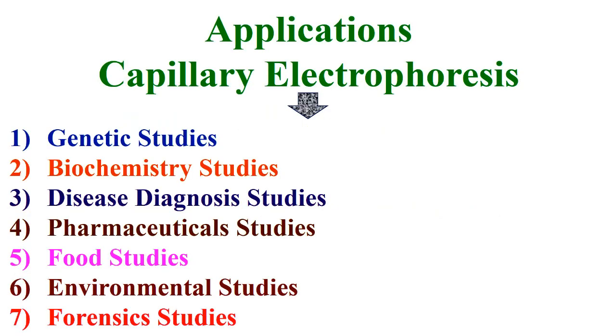Finally, capillary electrophoresis is used in genetic studies, biochemistry studies, disease diagnosis studies, pharmaceutical studies, food studies, environmental studies, and forensics studies.